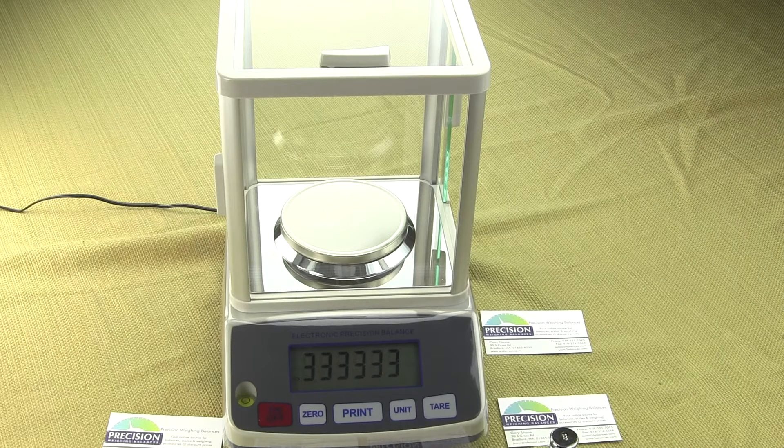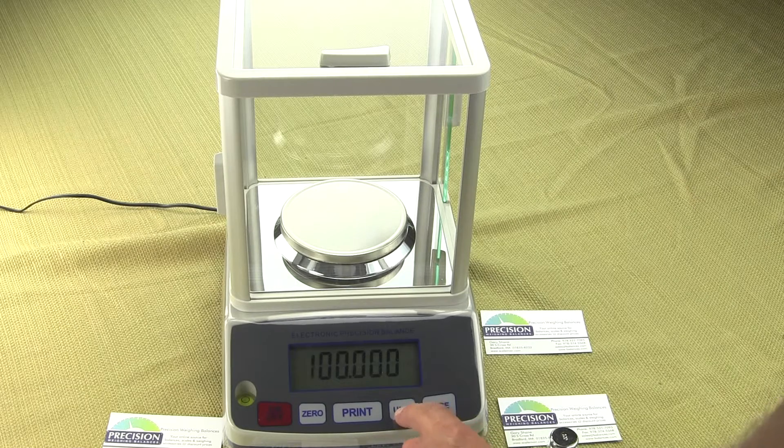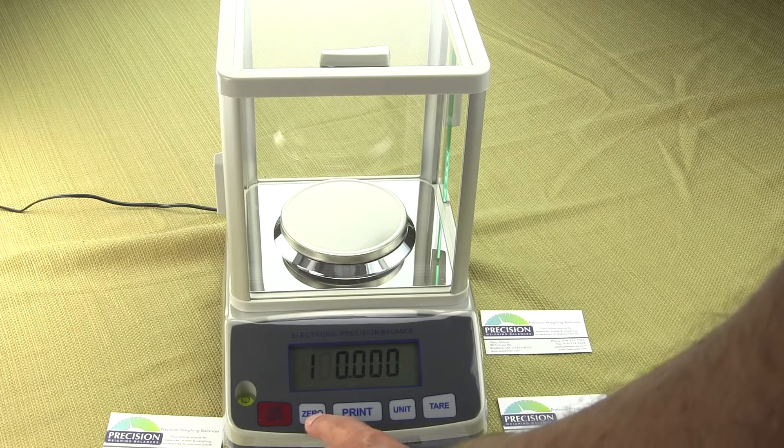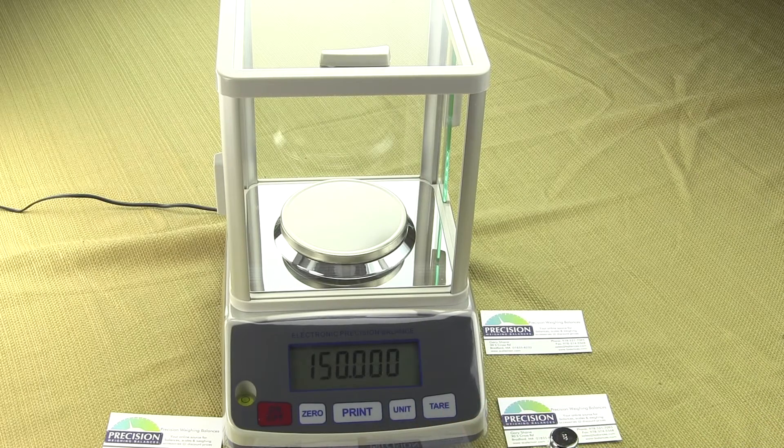As the balance counts down — two, one — and then shows dashes, press the zero key once. You will see CAL displayed. Press the zero key again and it shows 100. This is configurable — you can calibrate with a 200-gram weight or a 50-gram weight; it's always recommended to use at least 50% of the weighing capacity. To change the calibration weight value, press the unit key to move over one digit, and press the tare key to increase it. For example, if you had a 150-gram weight, you could calibrate with 150.